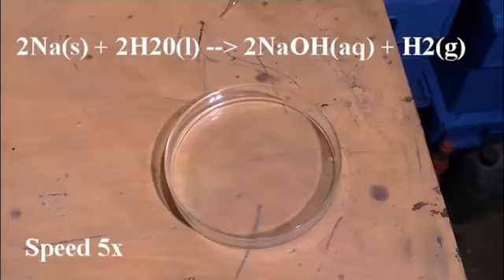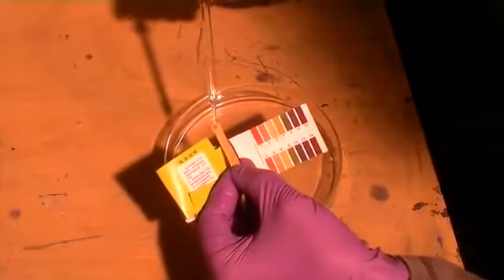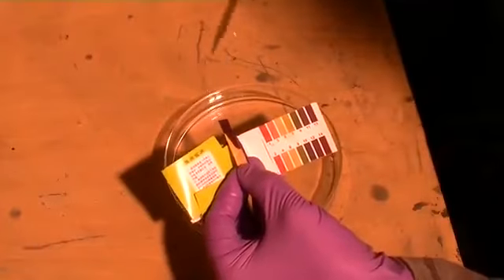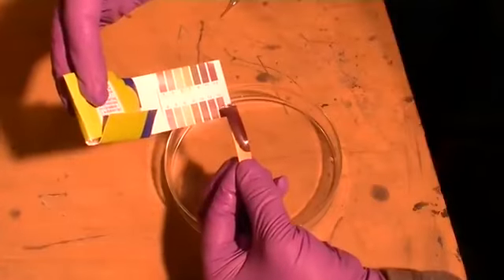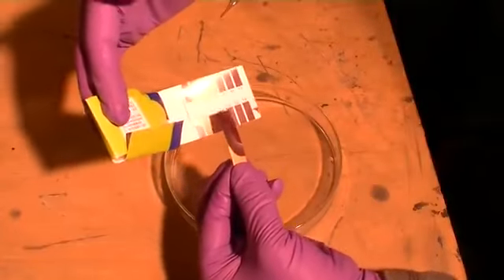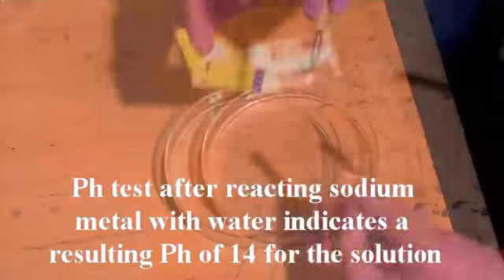Once all the sodium metal has reacted, we've measured the pH of the liquid again, and this time it is alkaline, with a pH of 14. This is due to the formation of a solution of sodium hydroxide.